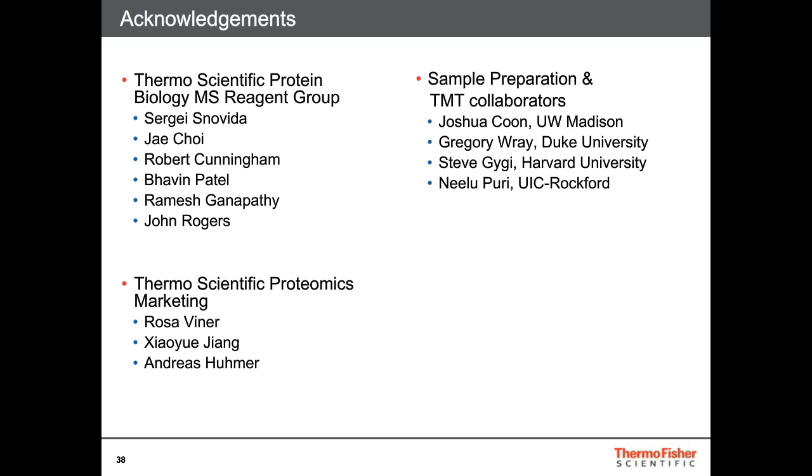That being said, the colorimetric assay does work well, and you can measure in Tris or other digestion buffers. However, the chemistry in those colorimetric kits is based on the same chemistry as the micro BCA. It has a slightly different chelator that gives much better signal to noise and sensitivity at the low end, which is great for peptide samples because you can use a lot less material than you would for a micro BCA assay. However, there are things that do interfere with the BCA assay.